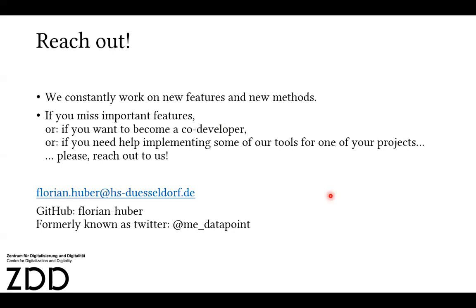Python tools, about MS2DeepScore, MS2Query, please reach out to people like me, Justin, because we're constantly developing new features and new methods. And as I said several times, I'm not a chemist, I'm not the expert on the domain side. I'm trying to adapt machine learning, deep learning and data science methods and Python software development for this kind of community. But I always rely on good collaborations, and so we're always interested in hearing from you what you actually really care about, what kind of things you need or are missing.